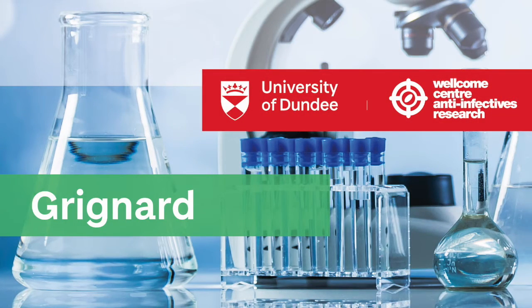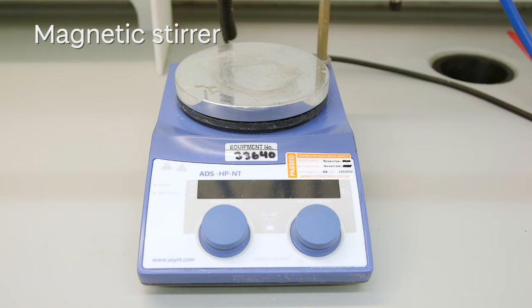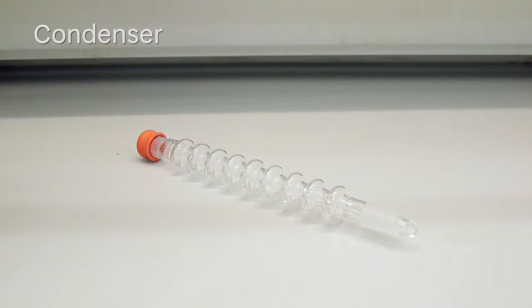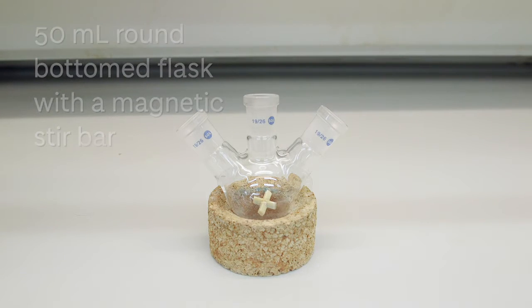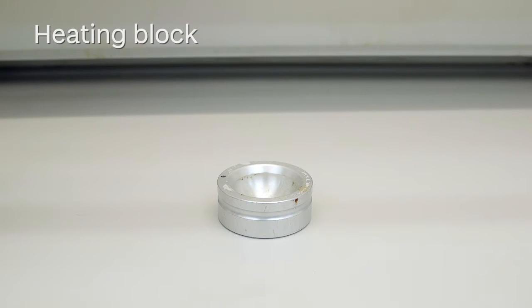We are going to go through how to make a Grignard directly from elemental magnesium turnings. We will need a magnetic stirrer, a condenser, a 50 mL round bottom flask with a magnetic stir bar, and a heating block.